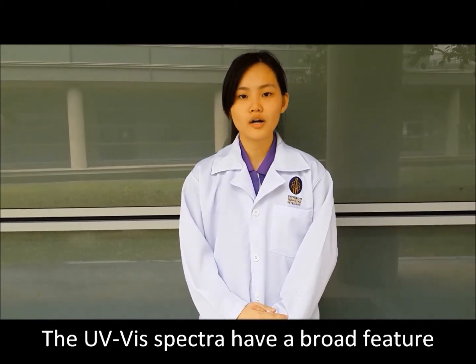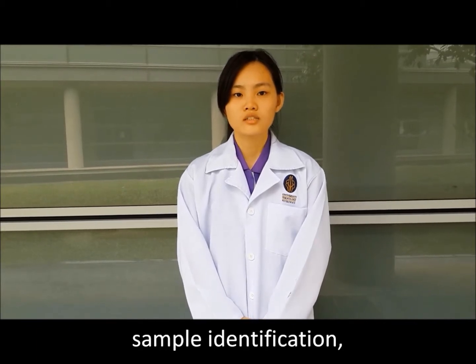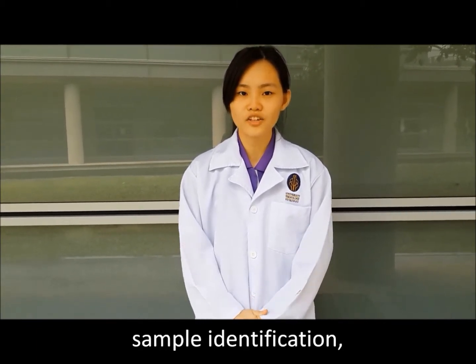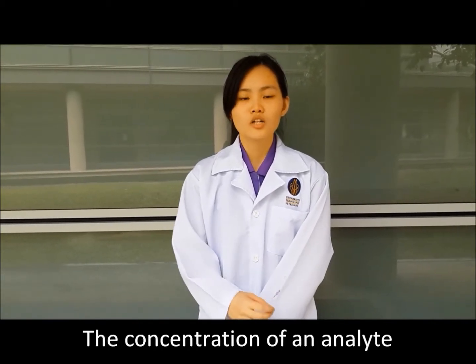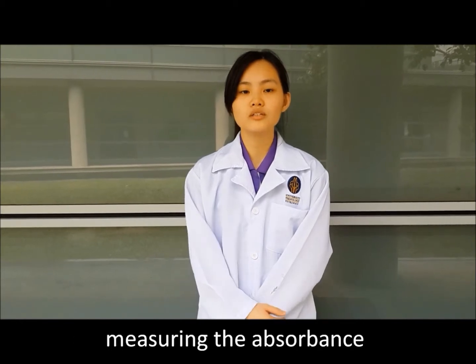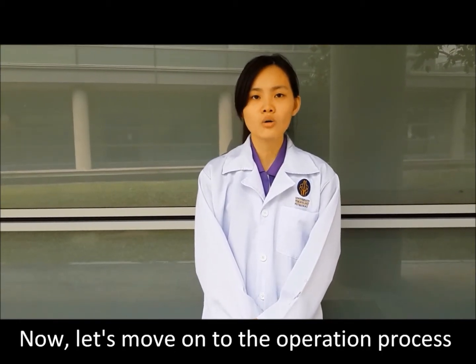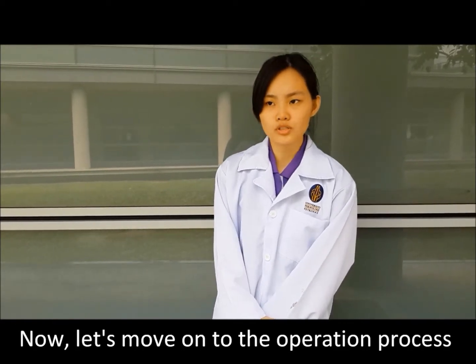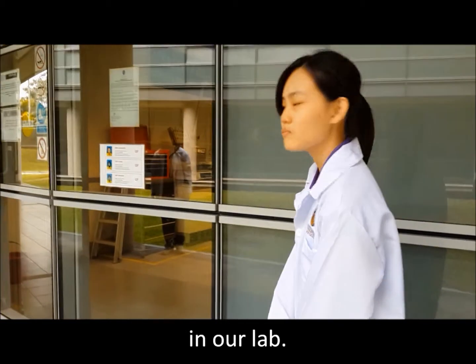The UV Vis spectra have broad features that are of limited use for sample identification but are very useful for quantitative measurements. The concentration of an analyte in solution can be determined by measuring the absorbance at some wavelength and applying the Beer's law. Now, let's move on to the operation process for the ultraviolet and visible spectrometer in our lab.